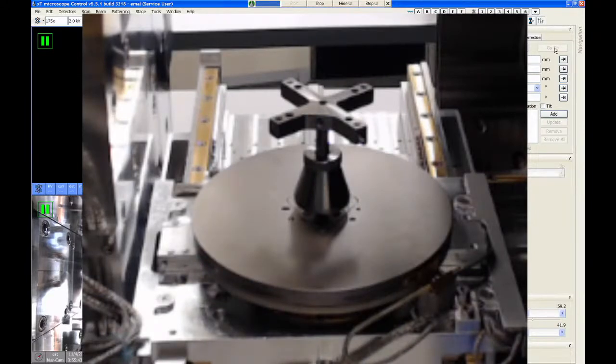You can touch the outside of the chamber without gloves. That's fine. But don't touch anything that is actually under vacuum when the system is in operation, because we don't want to transfer those oils from your skin or oil from the gloves into the microscope chamber.